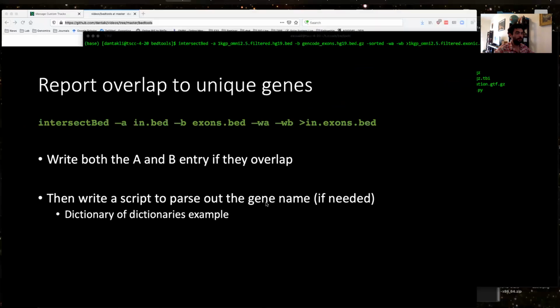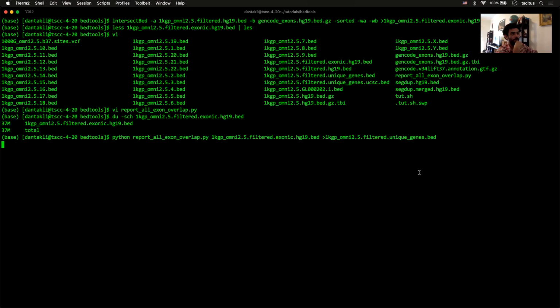All right. Well, hopefully that was clear. And then while it's running, the last thing I'll show you is how to put something on the UCSC Genome browser. Now, the reason why that's nice is that sometimes you just want to do sanity checks, and for me, working in bioinformatics, you tend to just get used to data as text and things like that, and you might be a little detached from the biology of it, right?